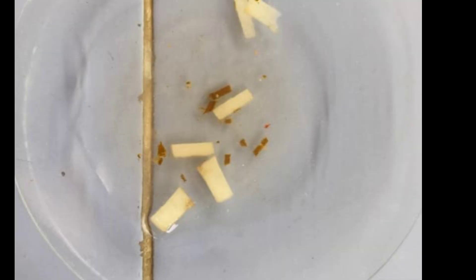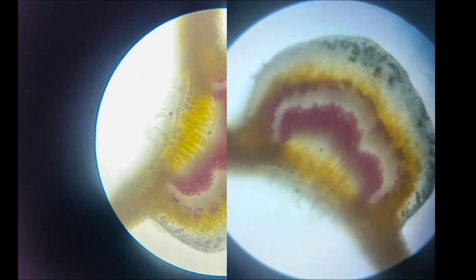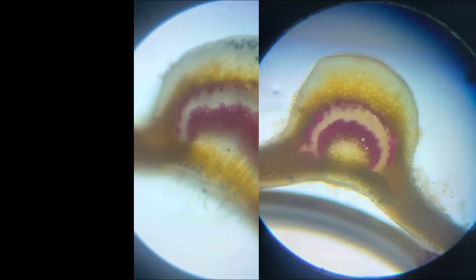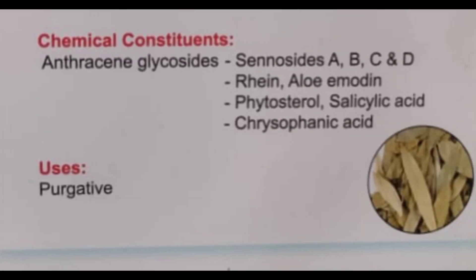Collect the thin section samples in a watch glass and add fluoroglucinol and concentrated HCl. Observe under 10x microscope. These are some of the images of the transfer section of Senna leaflet.